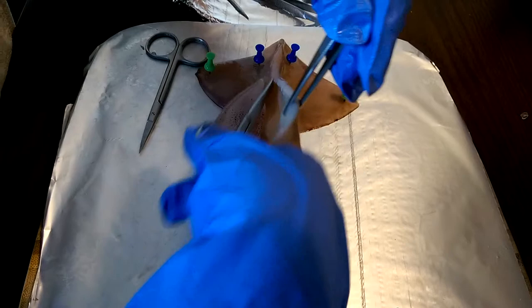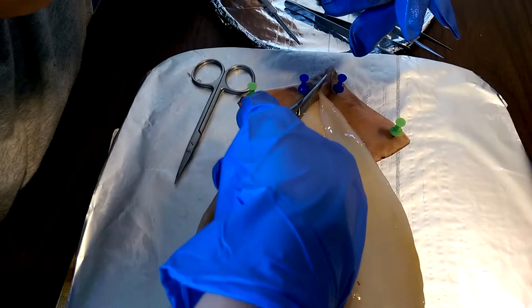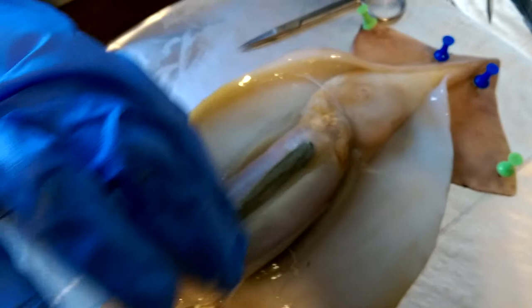We're about to see if it's female or male. Let me cut a little bit more to examine even better. These are my pins so it doesn't move. This is a female. Males are a little thinner than this. I'm starting to think it could be female or male, but I'm more sure this is a female. Anyway, this is the ink sack.